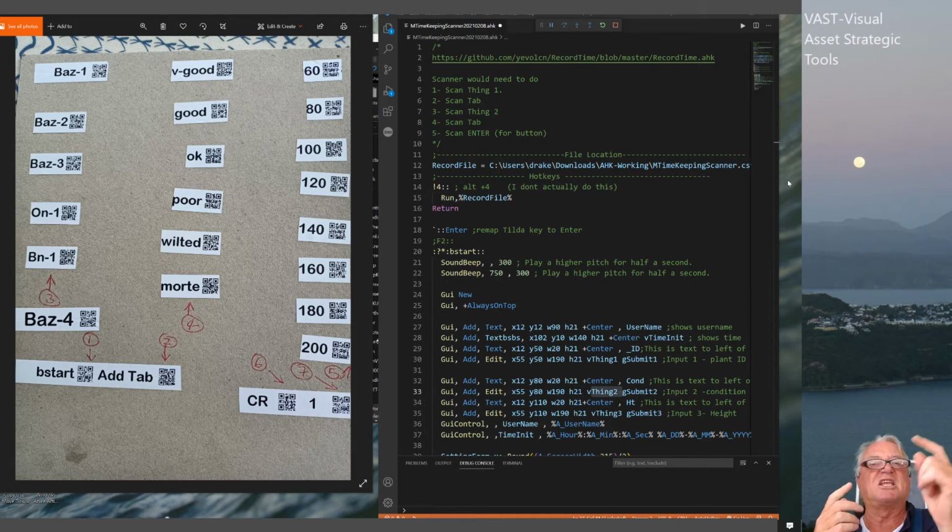That way it's done consistently: you just run the VBA script, tell it to pick up that file and append it to what I've got, and then it blows that other tab away after you've imported it into a new tab and copied it across where you want. In Google Sheets, you'd end up having to write a GAS JavaScript to do that.